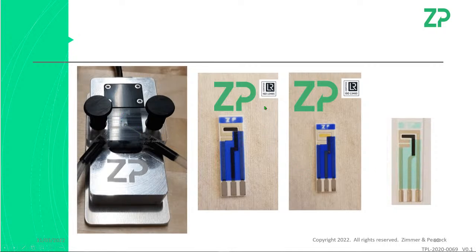So my primary suggestion is going to be the carbon 303s and the gold 303s. The reason I've mixed up the carbon and the gold is because it's worth trying both to see which gives you the best quality of signal. So I'm going to make a recommendation that you try both. Now, the hypervalue electrodes are actually so low cost, you might as well get a pack of them and just try them out, to be honest with you. If it seals well, great, and you get a much lower cost per test.